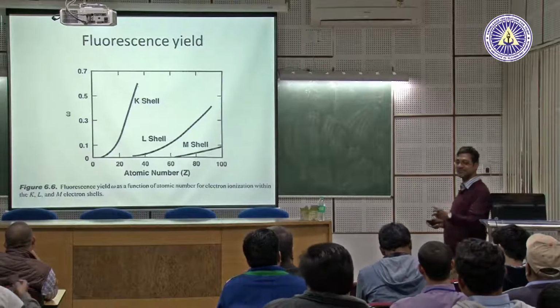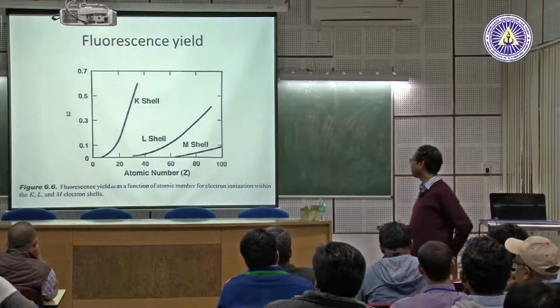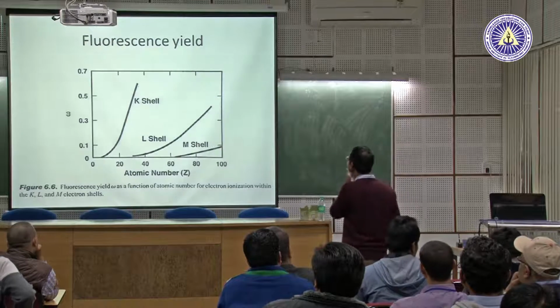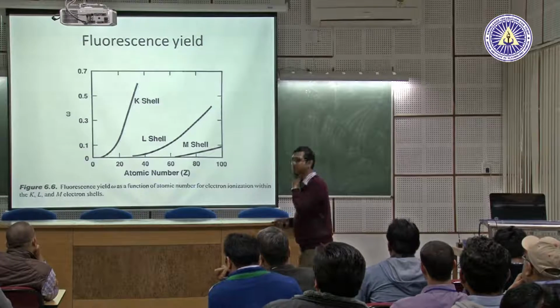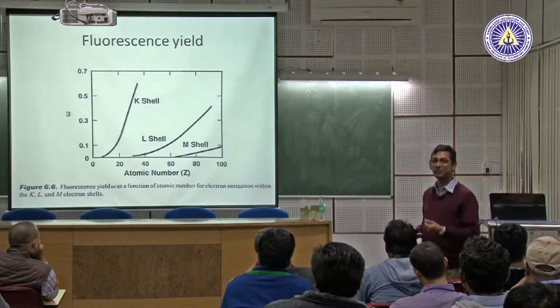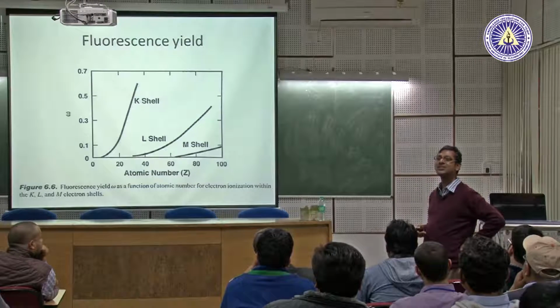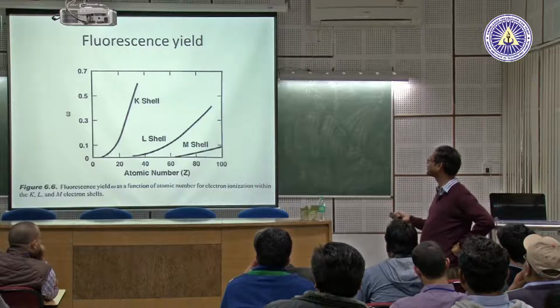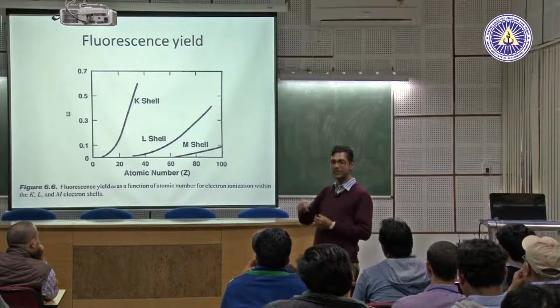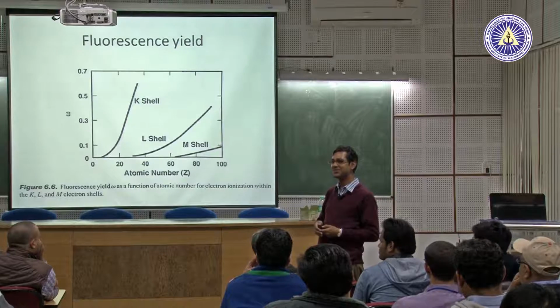Yes, now, this is also important, which you have probably not seen, this curve, right? We call the yield of X-rays the fluorescence yield, okay? Why? Let me explain to you. We always tell our students that if you have a steel sample, don't do an X-ray diffraction study with copper targets, right? Because it can fluoresce. What is the meaning of fluorescence? The X-ray which is coming from the copper X-ray beam, what can it do? Does anybody in the class know about it?